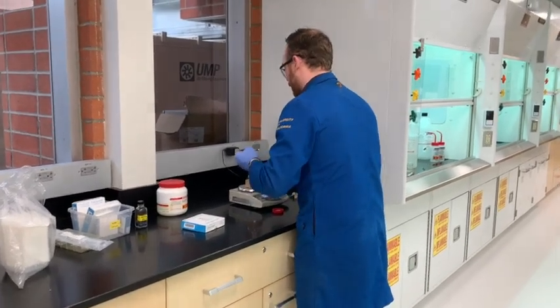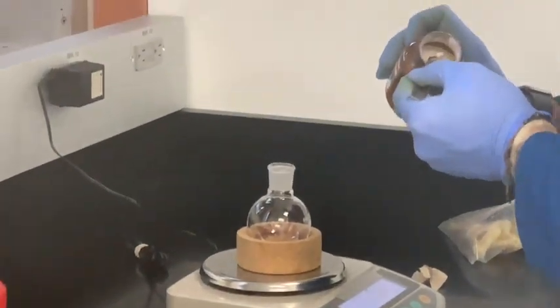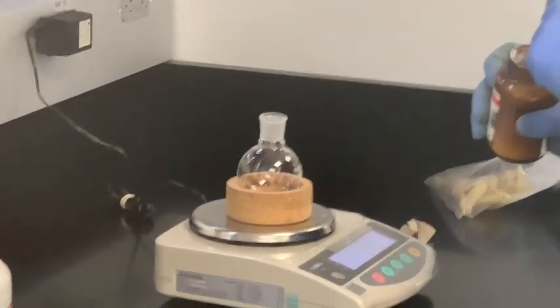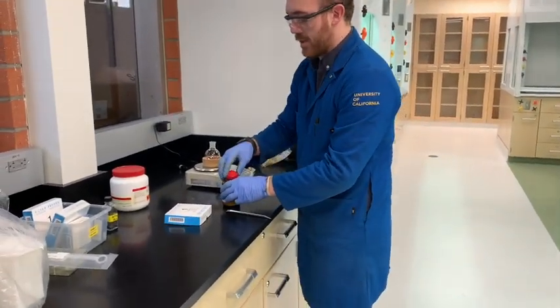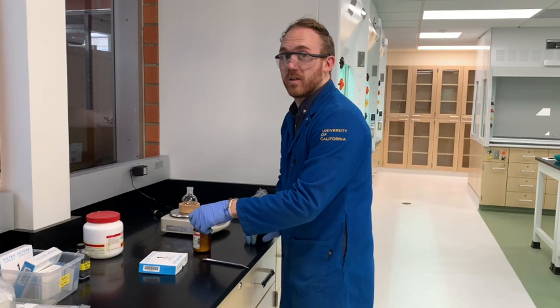This stuff is pretty chunky, so I might have to break it up. We got 0.180 — so that's good, that's plenty for what we need today. Make sure you give the spatula a little rinse with deionized water before you reuse it, because sodium borohydride is not something you want to put into other bottles of reagents.